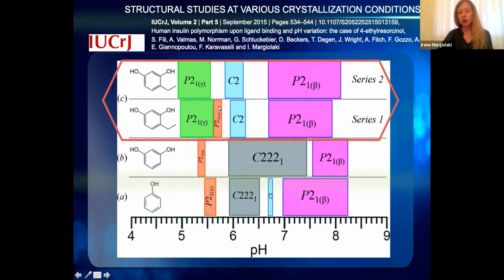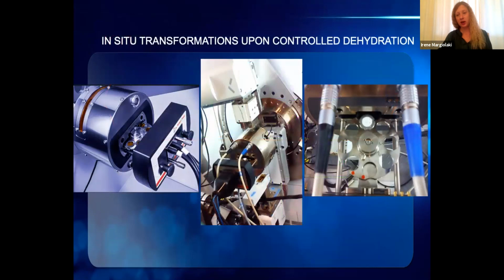This work lasted approximately 1 week, starting from sample preparation. So within 1 week, we had created a phase diagram, a polymorph map, for this complex of insulin with the specific ligand. That's very, very simple to do, even without knowing crystallography.